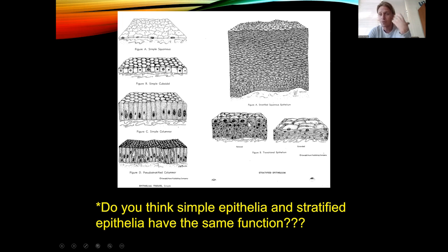All right, so this has to do with whether the organ's full or empty. And again, you usually see this in the ureters and bladder. So if the bladder is empty, no urine inside the bladder, everything will spring back to where it's supposed to be. And all the cells are going to make this kind of round pillow shape right here. And you can see this round shape doesn't really fit those other definitions very well.